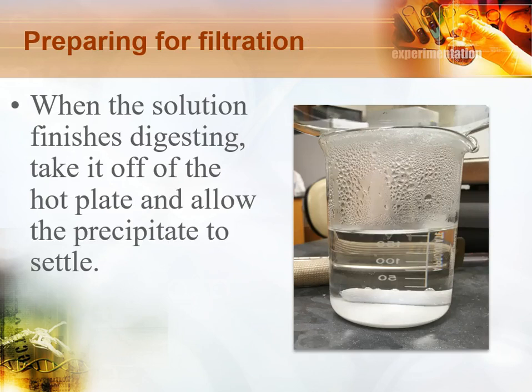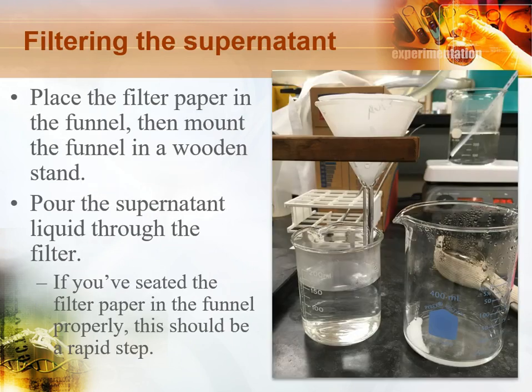So when the solution is finished digesting, you take it off the hot plate and let the precipitate settle. So here, hopefully, I have my large barium sulfate purified crystals.